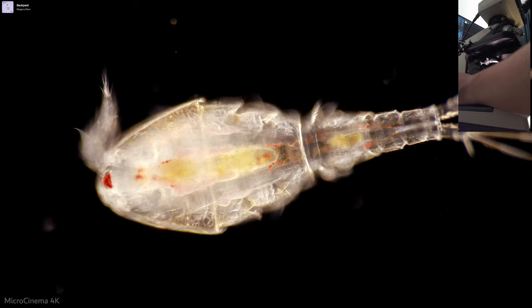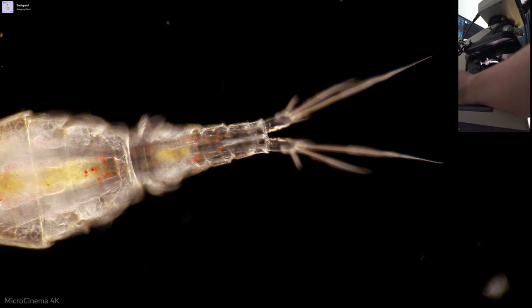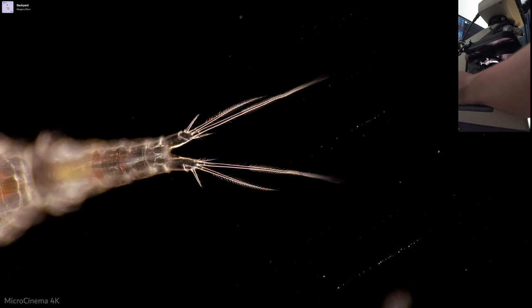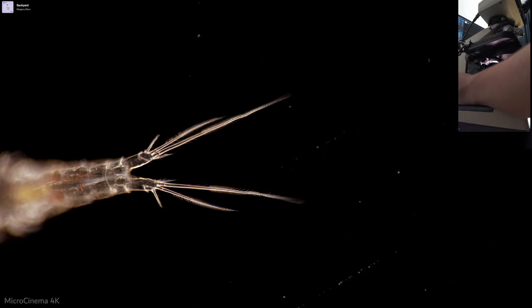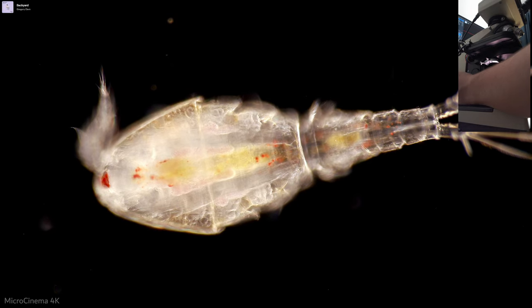I'm going to drop the exposure down a little bit. Look at this bad boy. I love it. Look at the little spines on the tail. Just so good.